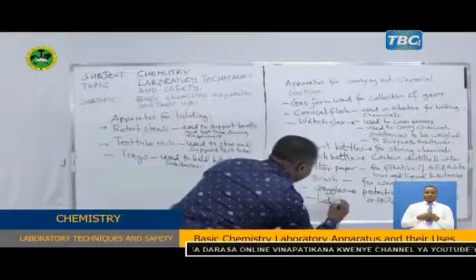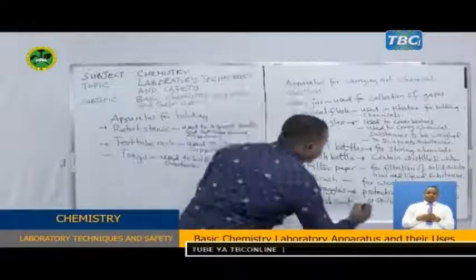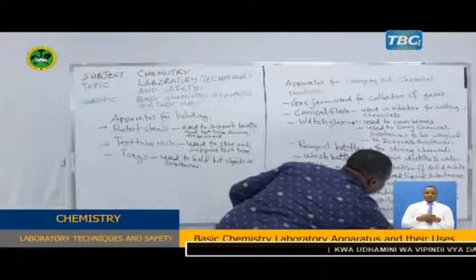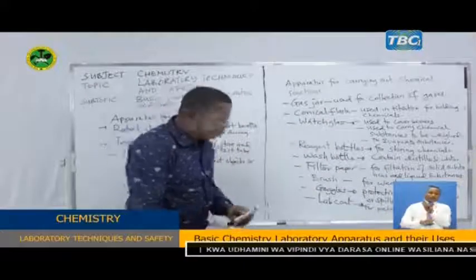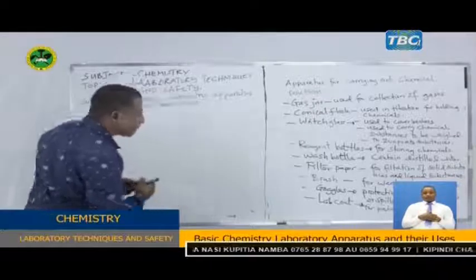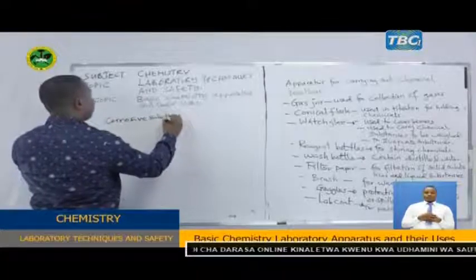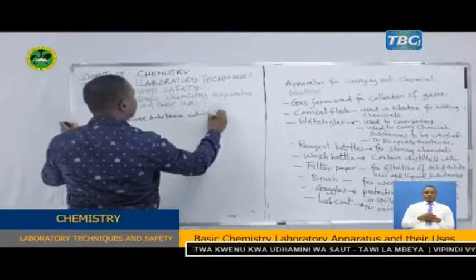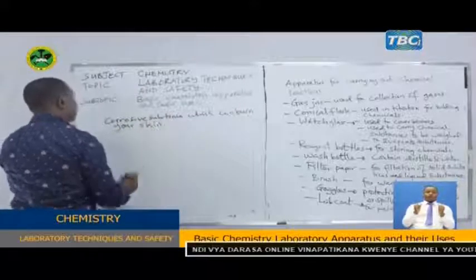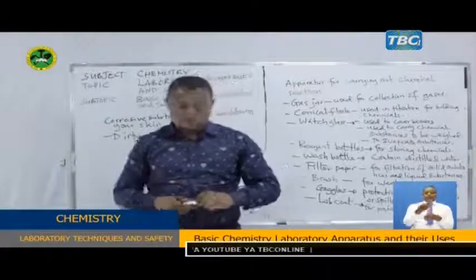So, lab coat, for protection against corrosive substances which can burn, or from dirt that can stain your clothes.